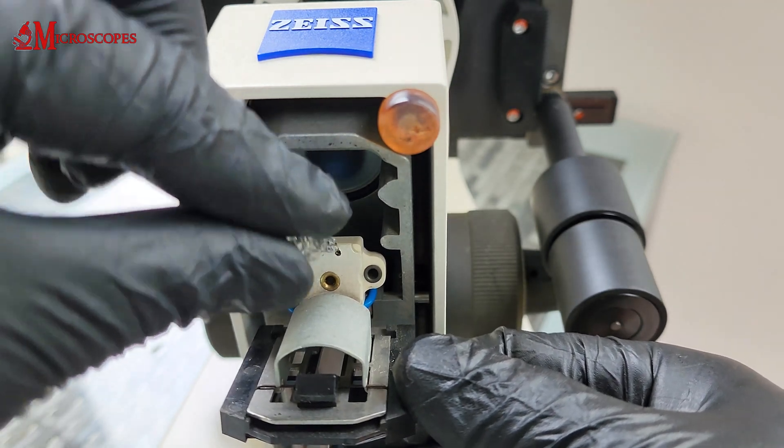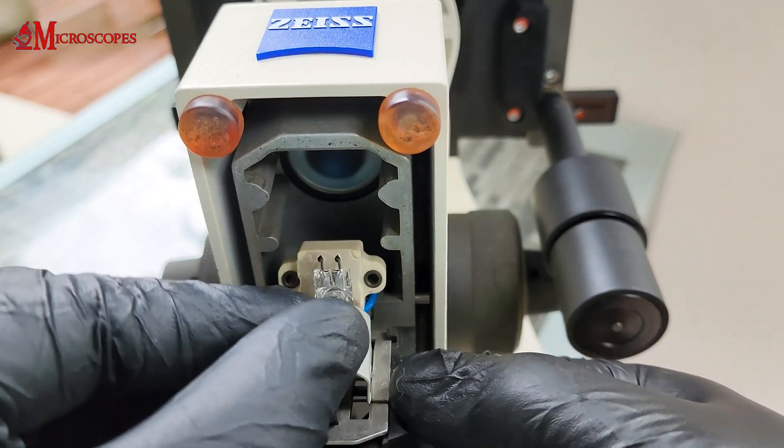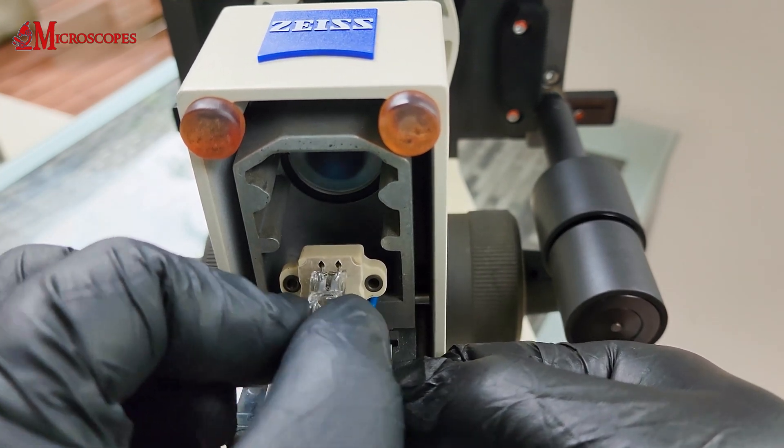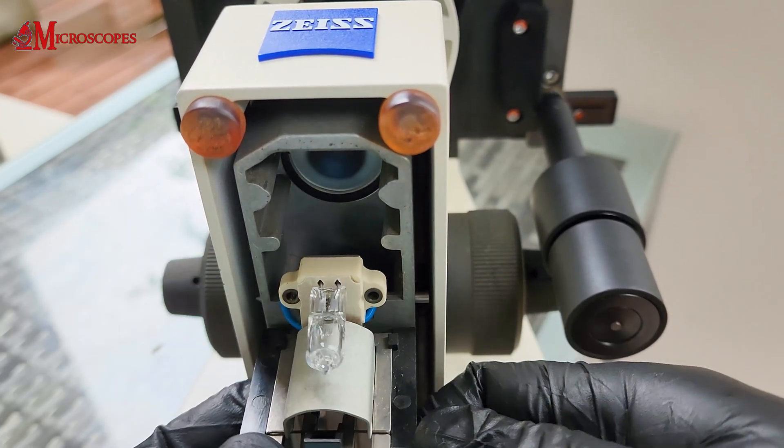Unclip the old halogen bulb from its socket. Install the new bulb. Avoid touching the glass part of the bulb with your bare hands as the oils from your skin can cause premature bulb failure.